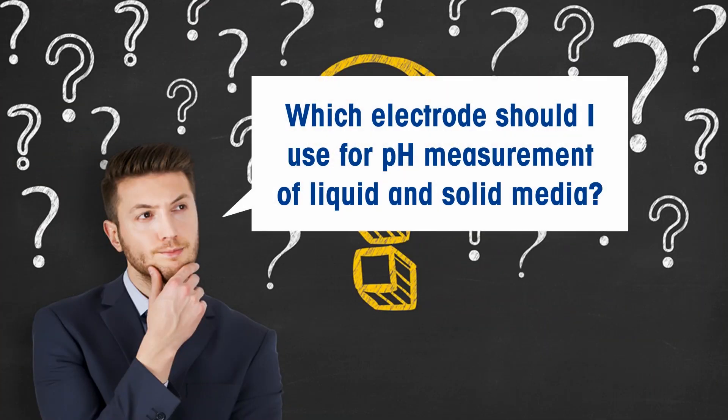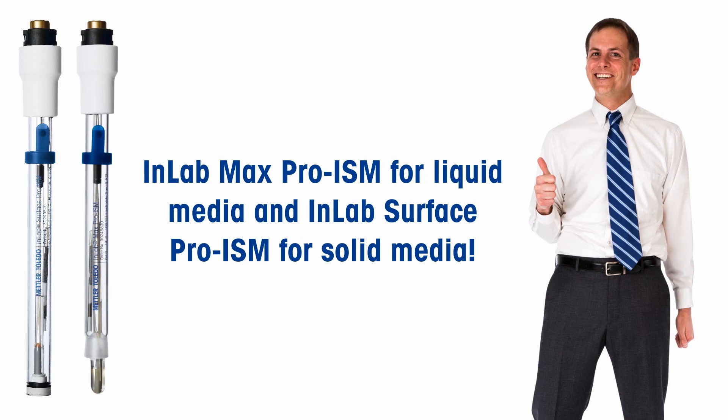With solutions from Mettler Toledo, measuring the pH of media samples is no longer a difficult task. Ensure maximum accuracy by choosing the right sensor for your application.